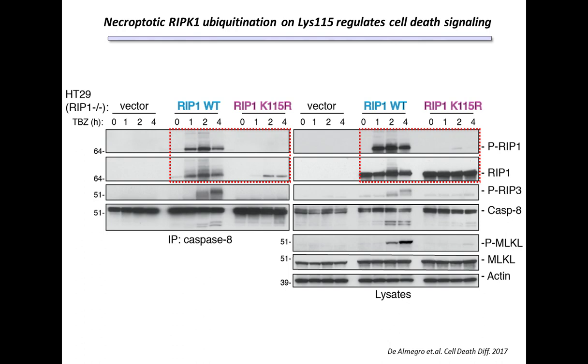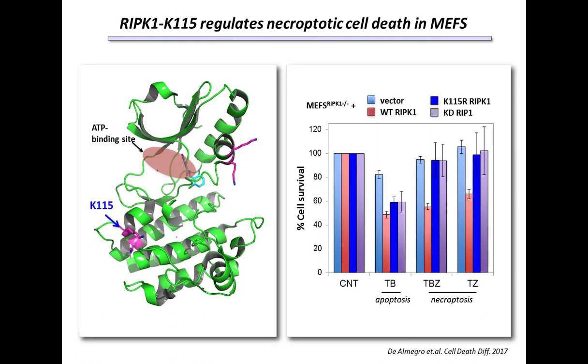First of those is on the right-hand side. You can see that K115R RIP kinase 1 is not phosphorylated, as is the comparable wild-type protein shown to its left. And moreover, we fail to see the high molecular weight bands or smearing that's reminiscent of the ubiquitin signal that we're detecting with the KGG profiling. Now, these two events not only exist within whole cell lysate, but also are found in samples that are immunoprecipitated with caspase-8, demonstrating their participation in a larger complex that's controlling the cell death regulatory machinery.